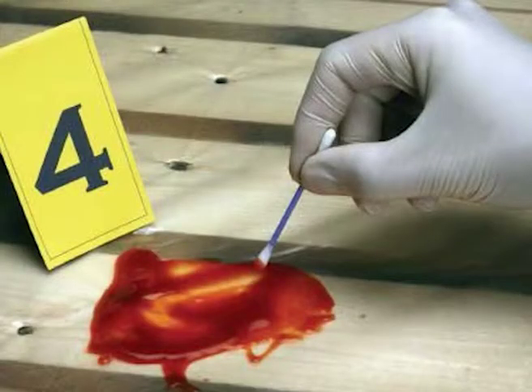Paint flakes can be removed by a number of methods like lifting loosely attached flakes, cutting samples of the entire paint layer structure using a clean knife or blade, dislodging by gently impacting the opposite side of the painted surface, etc. Once these formalities are complete, then for paint analysis, the sample size, condition and layer structure complexities are to be considered while deciding which technique is to be used.